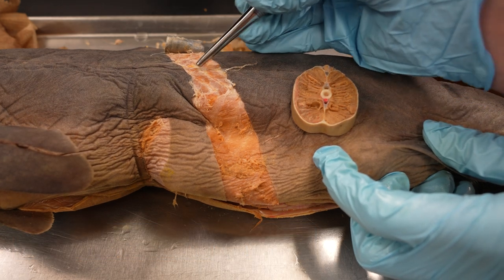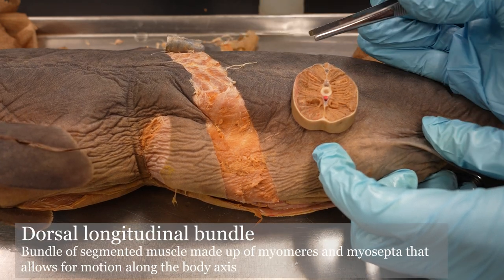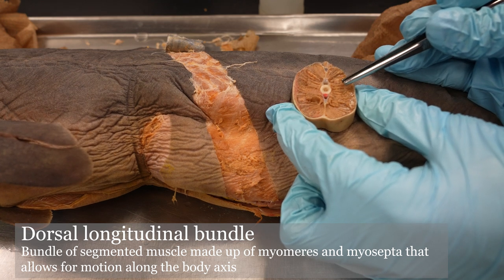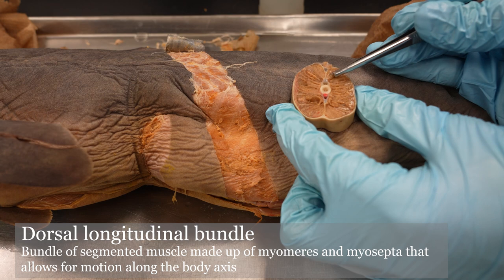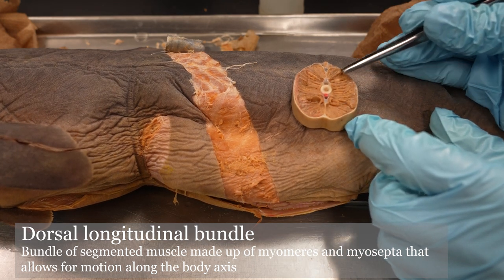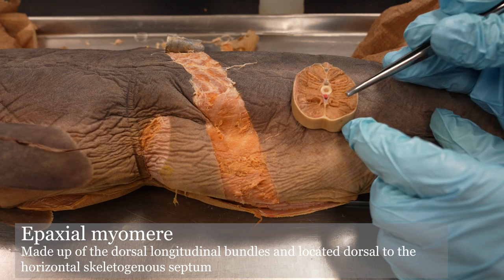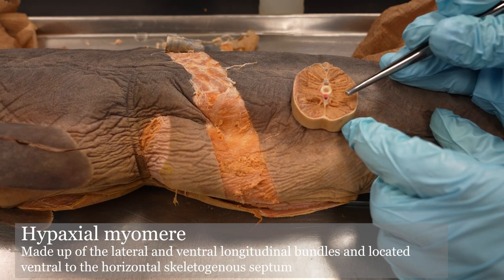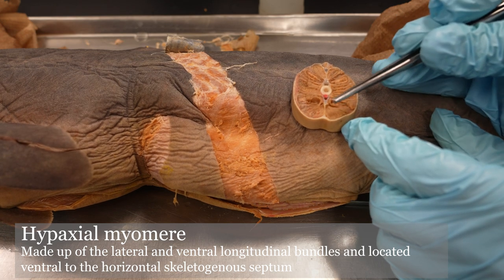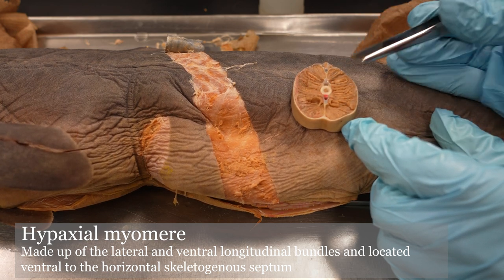Dorsal to that horizontal skeletogenous septum, we have the dorsal longitudinal bundle. There are three distinct bundles within that dorsal longitudinal bundle — this one, this one, and the smallest one there. Together, the dorsal longitudinal bundle makes up the epaxial myomeres, and the lateral longitudinal and ventral longitudinal bundles make up the hypaxial myomeres. 'Ep' means above, 'hyp' means below — so remember it's above and below that horizontal skeletogenous septum.